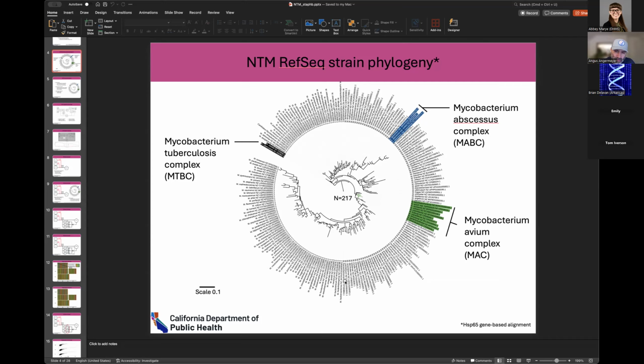And then are you guys reporting this back out clinically, back to laboratories? Would they be able to send a clinical isolate to you, and then for a patient who has COPD, send another clinical isolate to you for identification later on to confirm it's the same thing prior to starting treatment? Yeah, my understanding is that's the idea behind this.